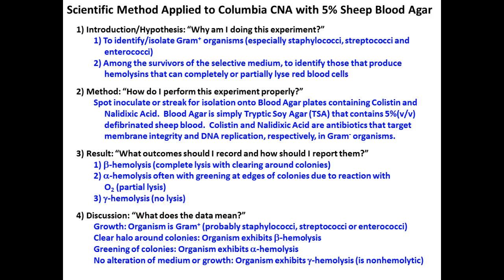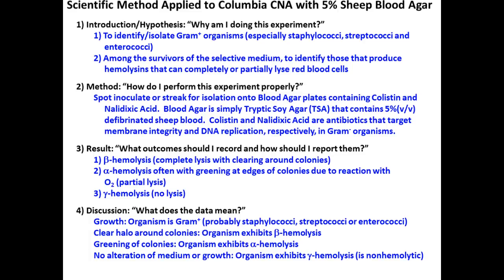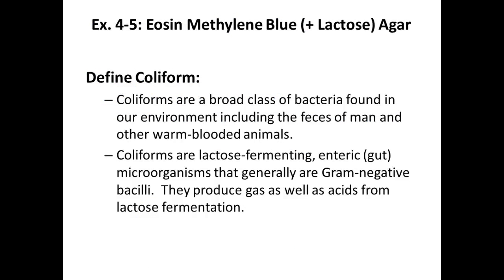We have one organism that's supposed to be kind of alpha, doesn't really come out really good, so I'm going to gross you guys out now. How I always know I'm going to get alpha is actually that one I swabbed is from my mouth. Most people have streptococci in their mouth, right? They're the ones that contribute to tooth decay when you feed them sugar, right? So that is actually organisms from my good old mouth that made that nice green one on y'all's plates that I did yesterday. And I have to say, it's not as green as it usually is.